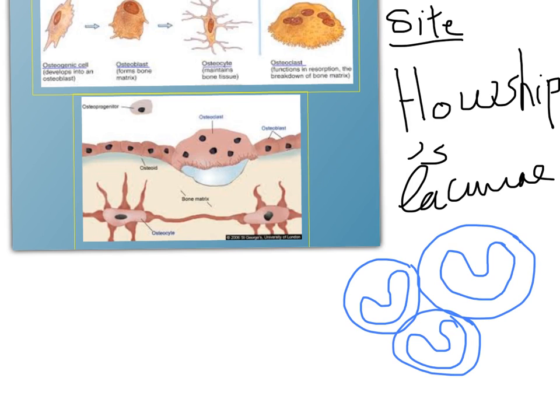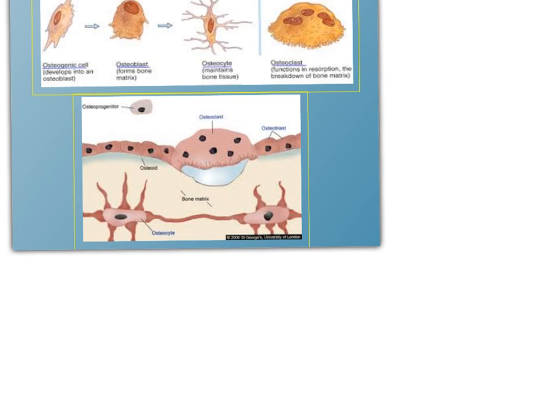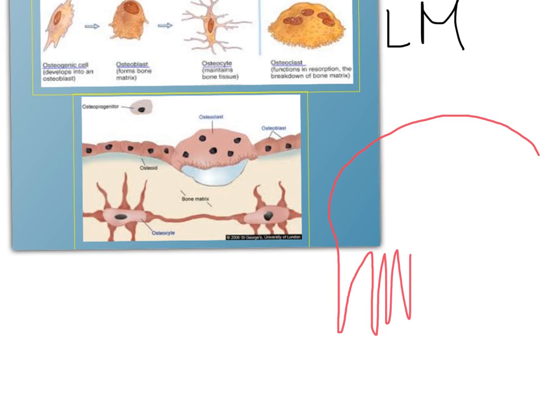As regards the LM picture, here the shape: first, it is a large irregular cell having a border looking like a hair brush.